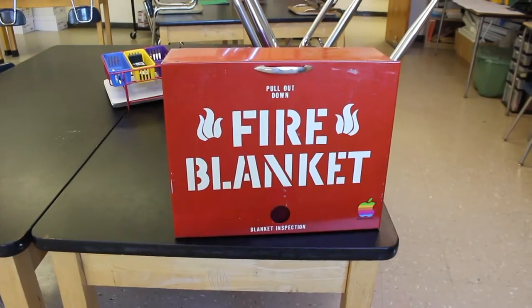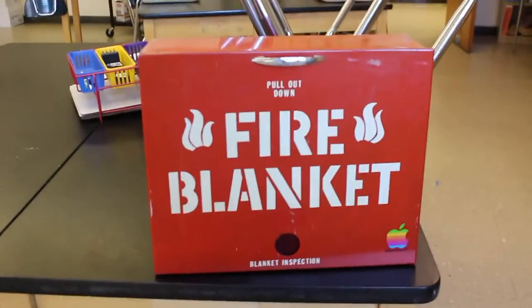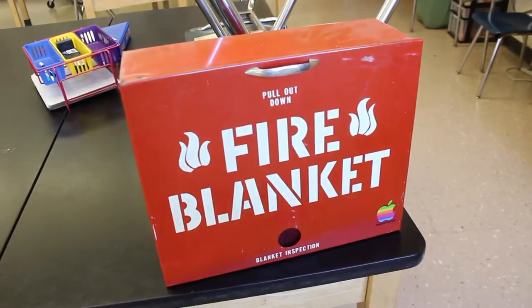My personal favorite piece of equipment is the fire blanket. The primary use is to aid stop, drop, and roll, but it has many other uses. You can cover a hazardous chemical spill on the floor, or throw it over a fire on your lab bench to control the flame. However, in a seriously hazardous situation, the priority should never be to save a lab bench or science materials — the priority should be to get people away. Nothing in the school is worth the loss of a student's or your own life.